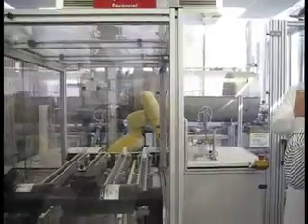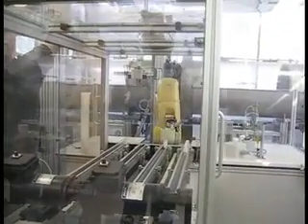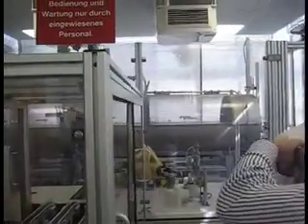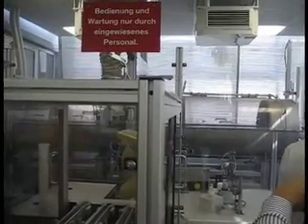Many people are often a bit rather shocked when the robot just simply lets the thing drop and dismantle. Is it going to run 24 hours a day? No, we normally have one. Except, of course, you have to have somebody to take the plant.